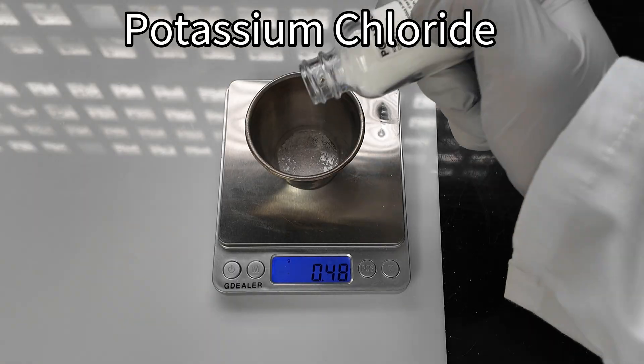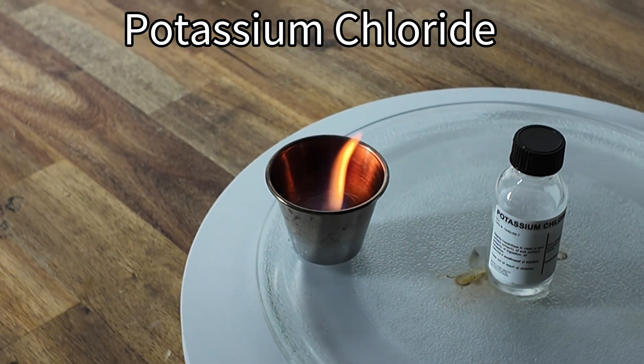Next up, we have potassium chloride. When this one is burned, we can see a lilac-white-purple flame.